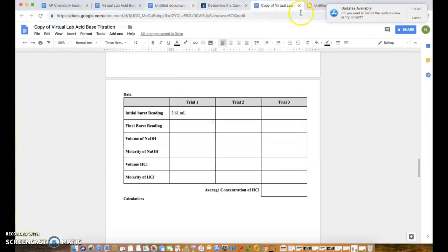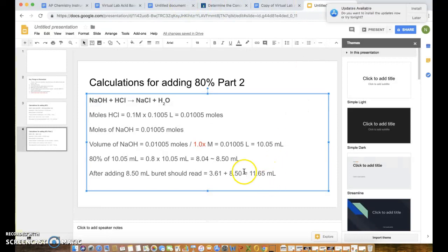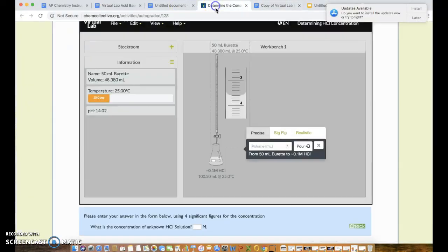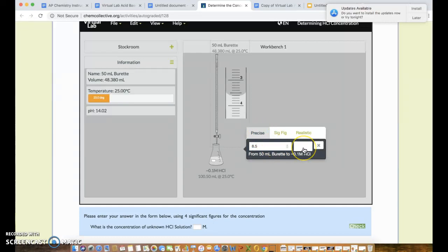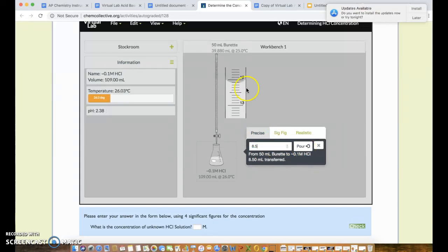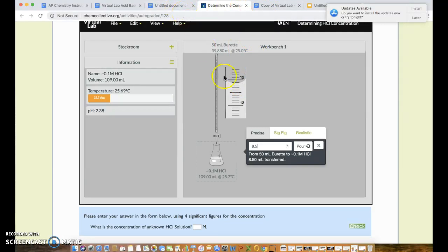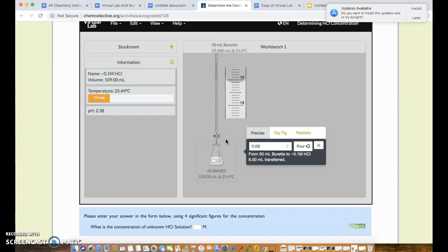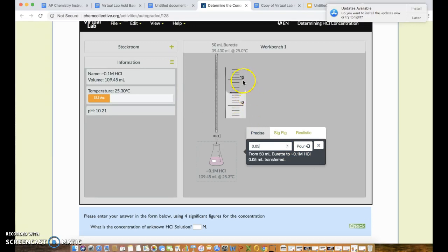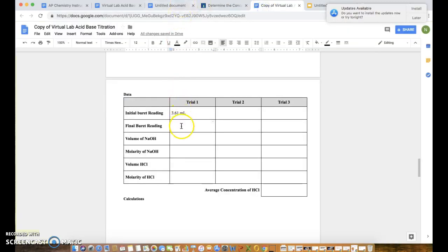So let's go ahead and just do that. Remember to add 80% of the volume I need to add about 8.5 milliliters, so that's what I'm going to add straight away and I don't have to worry about overshooting the endpoint when it's just 80%. So I add 8.5 and that does give me, my calculations may have been a little bit off because this is saying like 12 point something. So at any rate I have the volume here, I see that the pH is still acidic so now I can go ahead and start adding 0.05 milliliters at a time. And then I can stop here and then that tells me that the volume that I have here is 12.5, between 0.5 and 0.6 so 12.58 I would say milliliters. So going back to my document here 12.58.